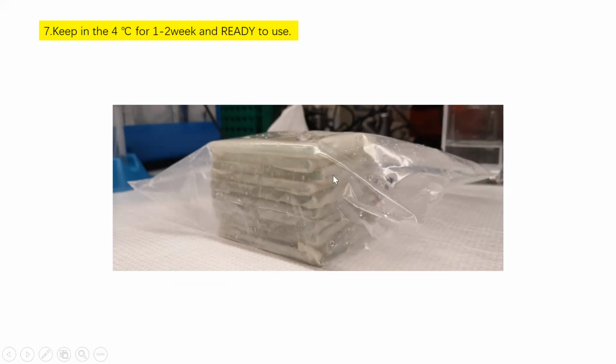Normally we will cover it with wet paper and put it in a bag and keep it in the refrigerator. It can last for 1 or 2 weeks, and every time we want to run the Western blot, we just get it out and it is ready to use. So we think it's a very easy way for us to make our gel.